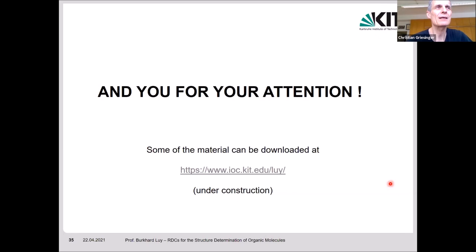Well, don't ask me the exact amount. I'm sorry, I don't remember at the moment. The phase correction can be calculated, so we always estimated it. When we had these data, we wrote a routine ourselves where you put in the value and then calculate the second order phase correction. It took us 2 tries, and then we always had a nice phase correction. So that was relatively straightforward and easy.